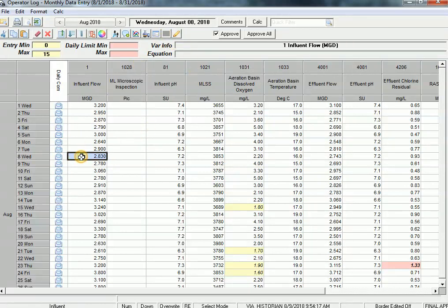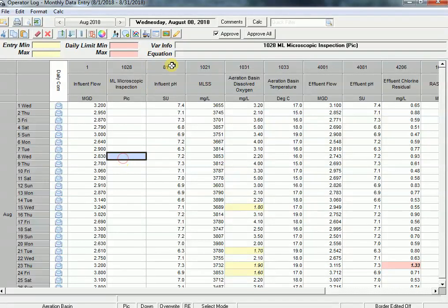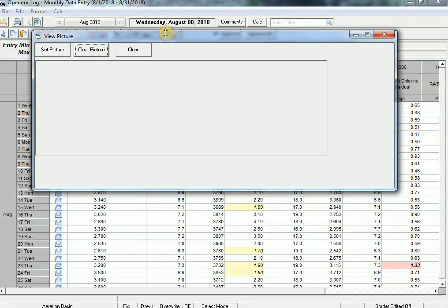Again, if I click here, it's disabled. So here, what that means is I can pick the picture. I go ahead and click it.